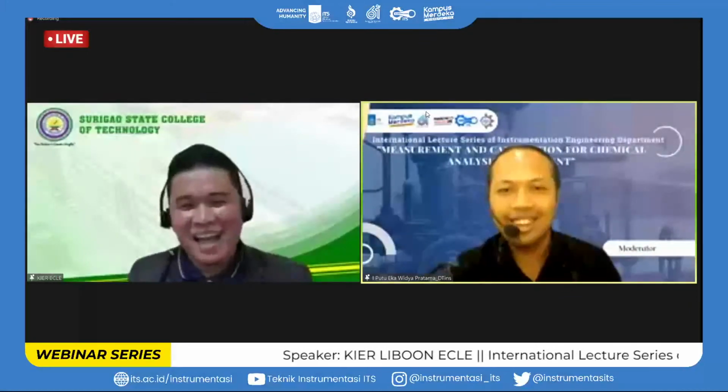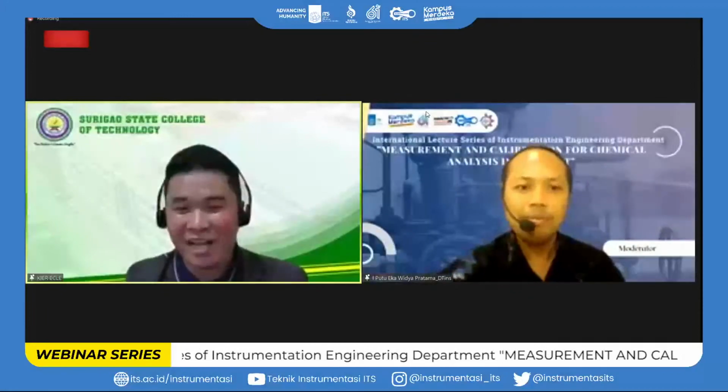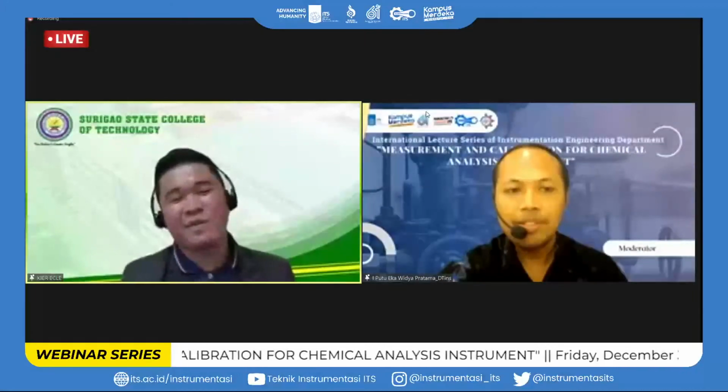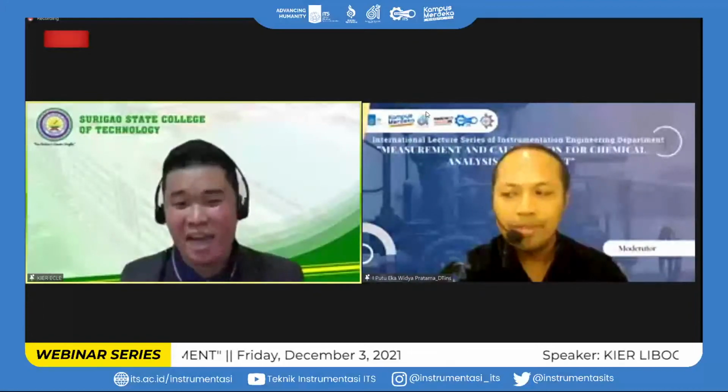It is more appropriate, sir, if we use AAS or atomic absorption spectroscopy, because this particular spectroscopic instrument is more appropriate in determining heavy metals.